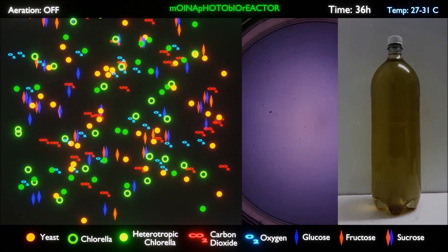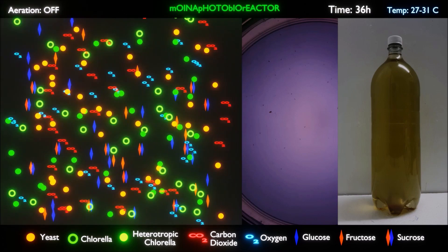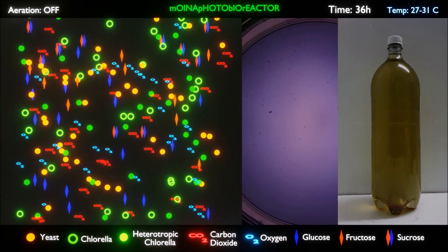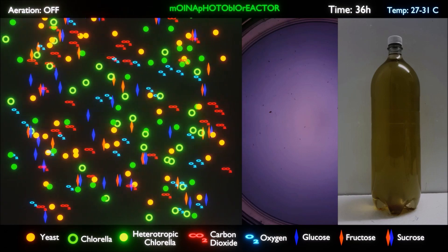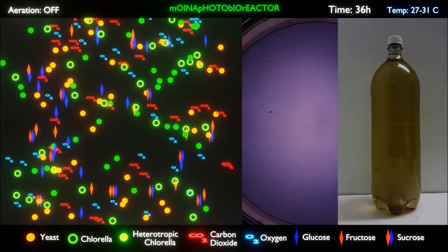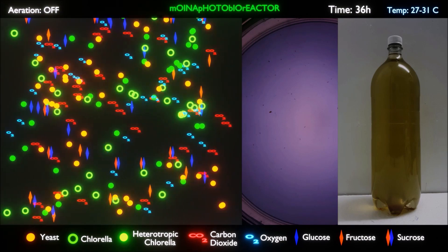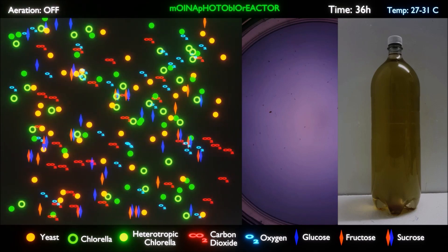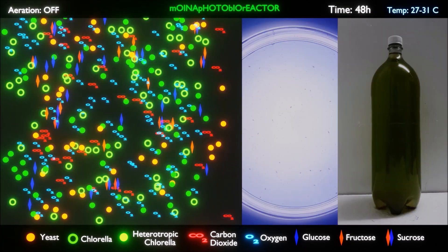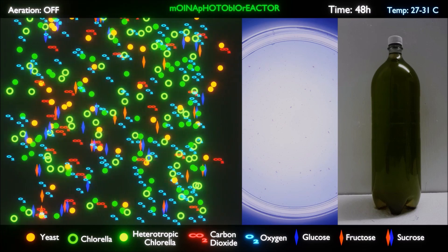After 36 hours, the Moina has reproduced, and when Moina is kept in such an environment it produces an average of 27 Moina nauplii per brood. The reason for large broods is due to the high content of fatty acids in the culture medium from heterotrophic metabolism of Chlorella. At the same time, Chlorella and yeast are propagating at a tremendous rate. Within 36 hours the color of the culture medium is already a solid pale green. After 48 hours the culture medium in the photobioreactor is solid dark green and the culture density of Chlorella and yeast have reached their peak, along with the saturation of dissolved oxygen and carbon dioxide.